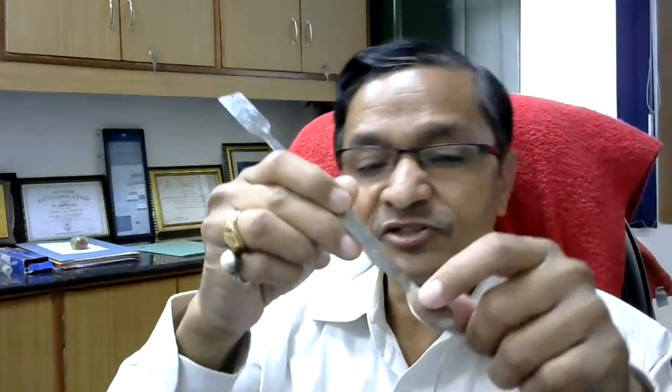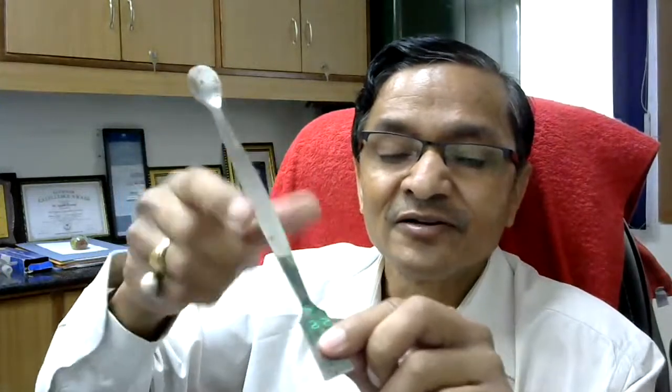There are certain chemicals which may react with metal. This is made of stainless steel and this is made of plastic. For some chemicals where metal should not be used, you can use plastic. Somewhere you will find that the plastic will get dissolved or be of no use, or will be destroyed. Then you have to use the steel or stainless steel spatula. This is something like a spoon and this is something like a knife, or you can say flat things. Depending on the requirement, you can use it this way or that way. This is called a spatula.